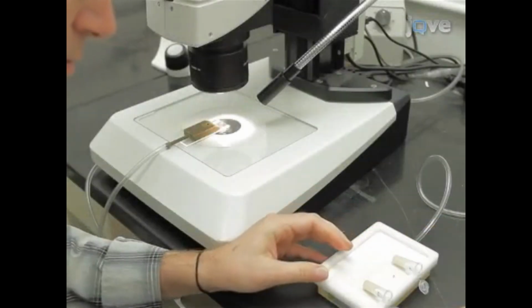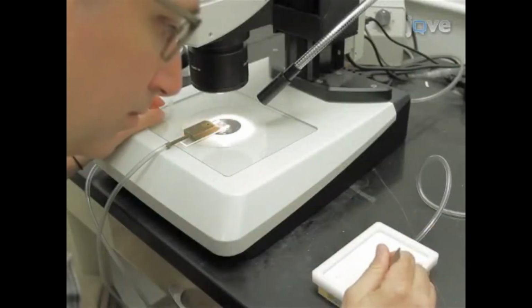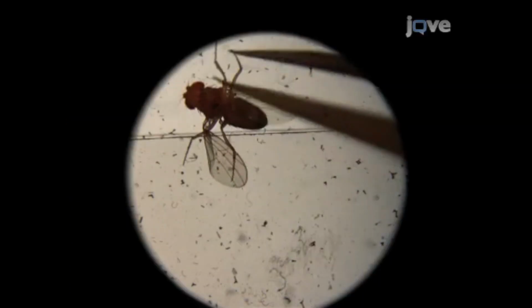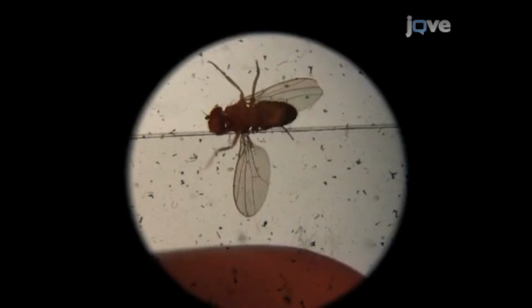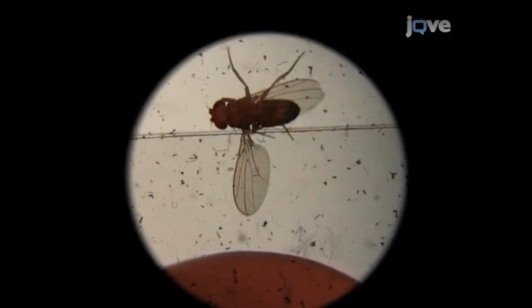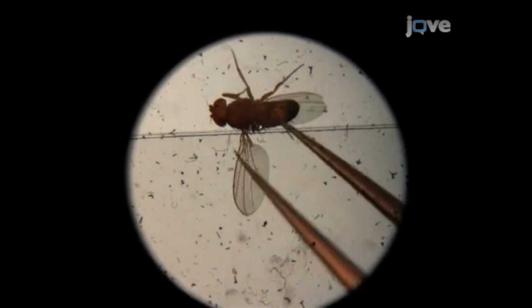Under a dissecting scope, lightly anesthetize the fly using carbon dioxide and position it using a wing grabber, a suction device that pulls the wing between 2 pieces of glass and holds it perpendicular to the fly's body for imaging. Although a wing grabber is used to image wings of live flies in this study, wings and other traits can be dissected and imaged with normal tools.